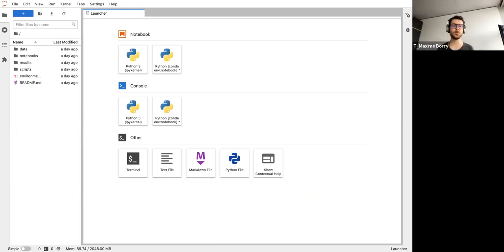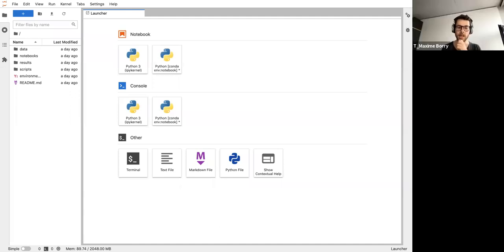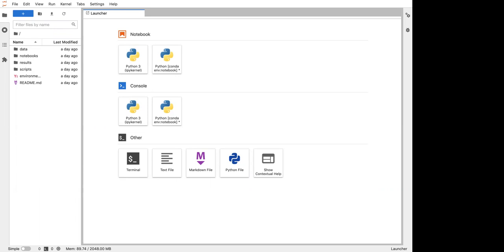This is why there are also other techniques that I'm not going to talk about today, that you can find in this review that I posted, and also in the reading that I put in the GitHub. You can use de novo assembly methods to look at these sequences that are not present in reference databases. Okay, thanks.